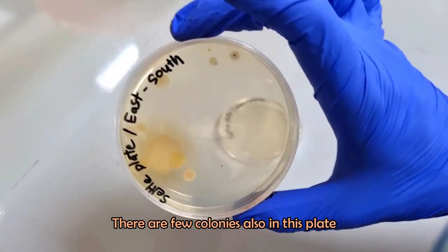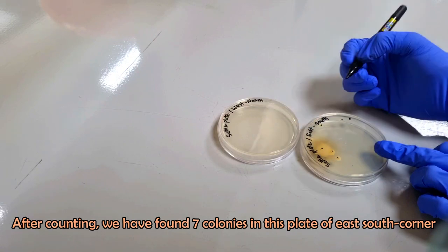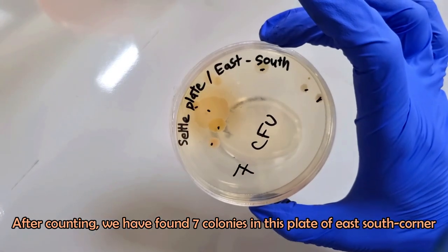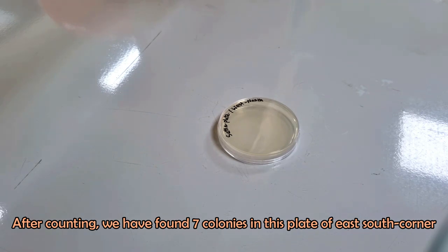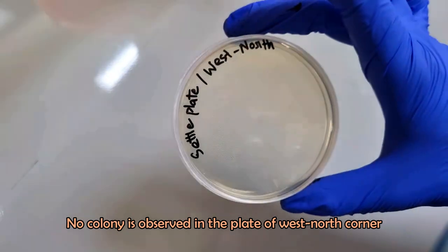There are also a few colonies in the next plate. After counting, we have found seven colonies in the plate of the east-south corner. No colony is observed in the plate of the west-north corner.